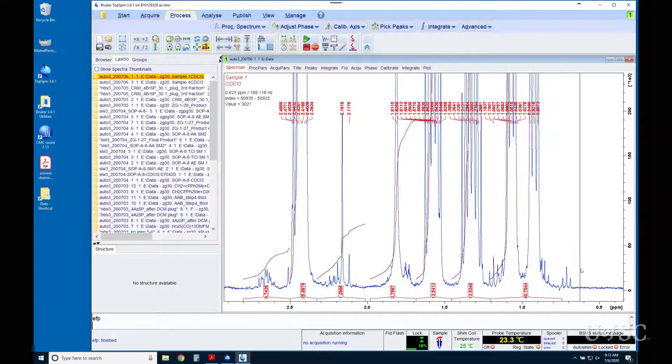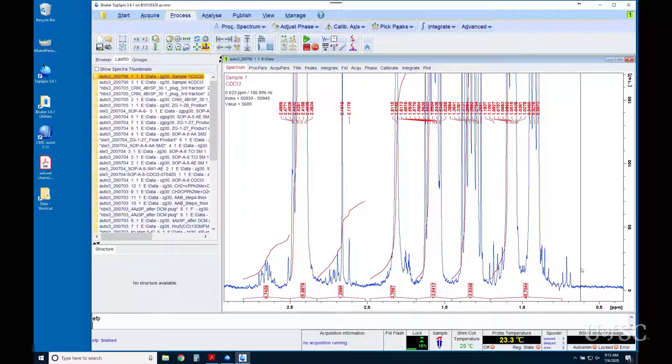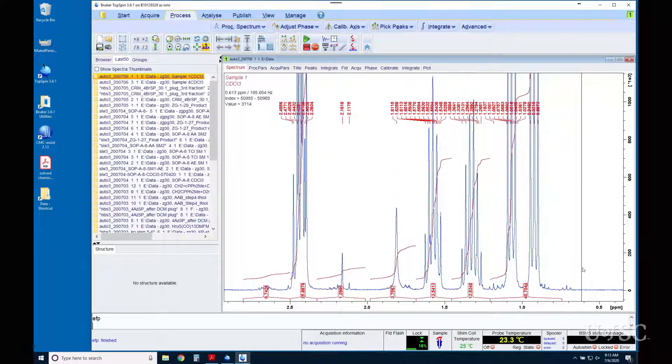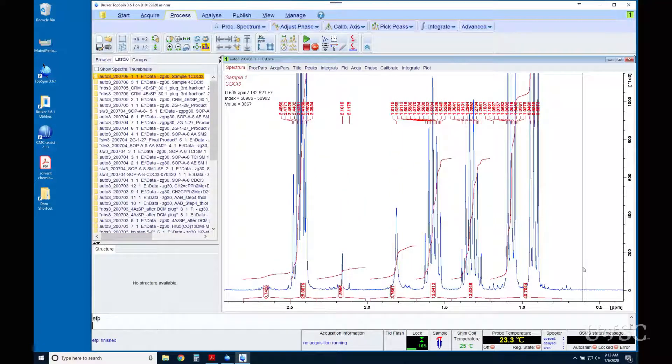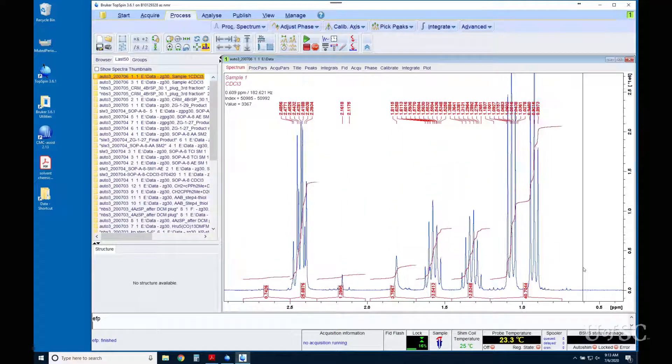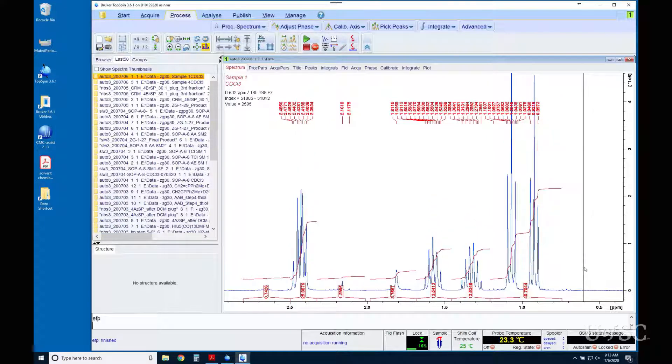For dilute samples that give noisy spectra, try increasing LB in steps to determine the best compromise of sensitivity and resolution.